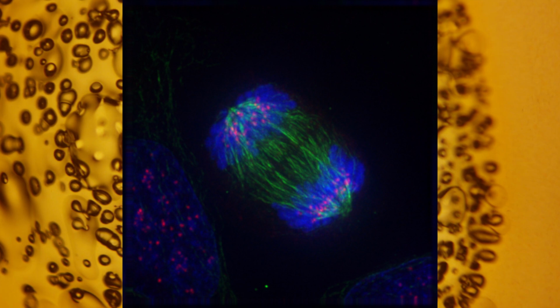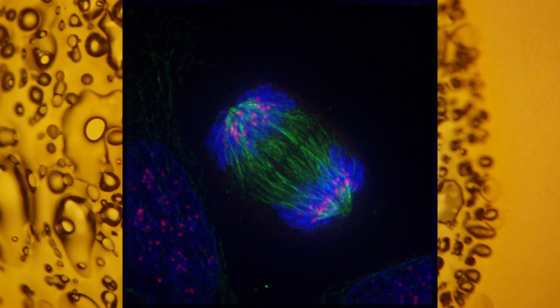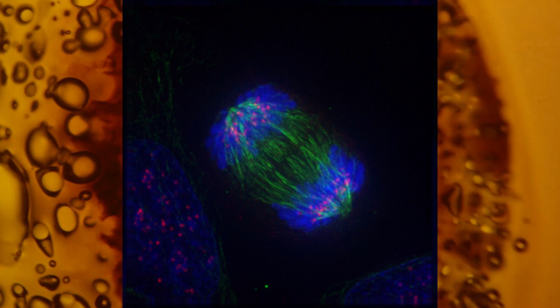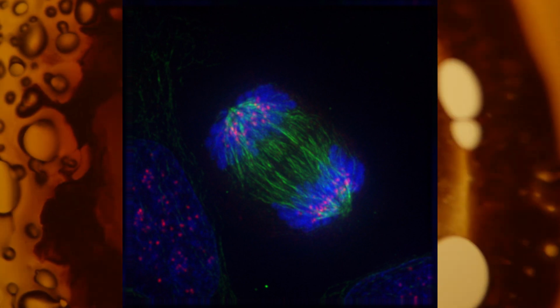And when you have that single structure, you are only able to look at that alone. Now, if you add 2 or 3 stains, you might be able to look at a few more things at the same time if they have a similar excitation wavelength and very different emission wavelengths. But you're really limited in how much you can look at any given time.